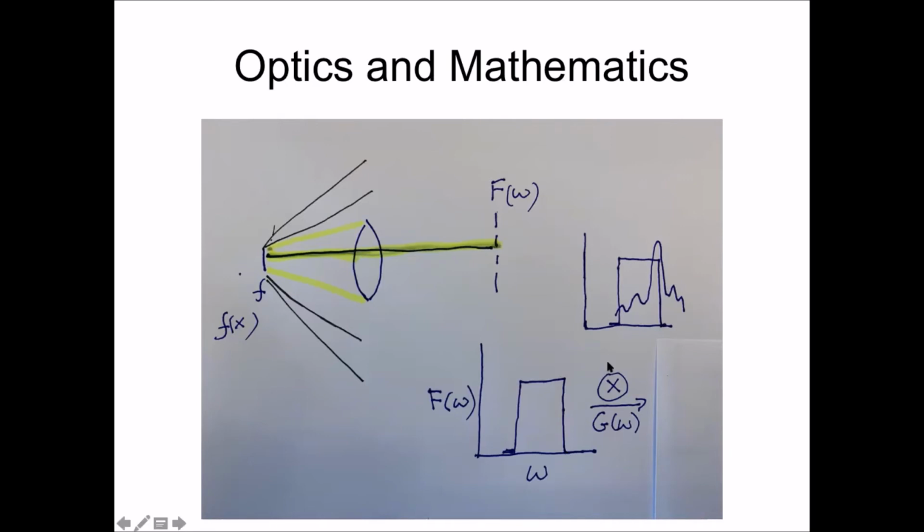But if you now put another imposed, say, grating on your sample, and that grating had some sinusoidal behavior with higher frequencies, etc., you would in fact be able to get a convolution of these two functions in the Fourier plane.